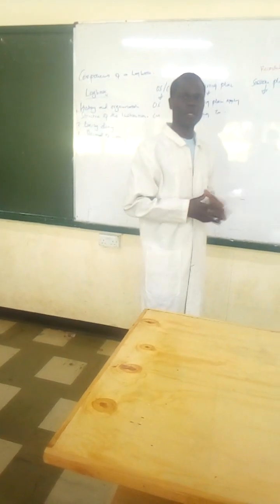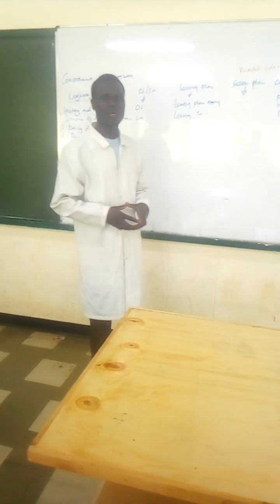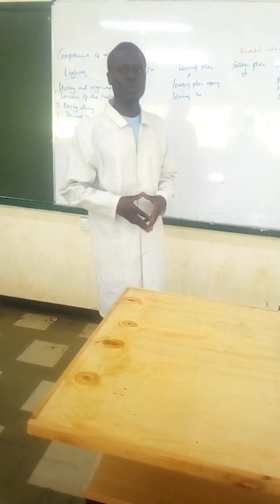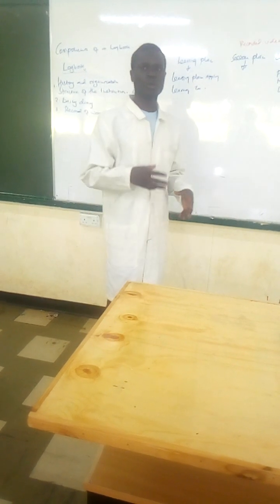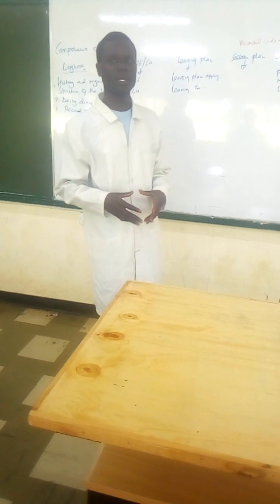So in this subtopic, you will know what gram staining is and the type of staining we normally apply. Gram staining is just a method of staining we normally use to classify bacteria into two broad groups, either gram positive or gram negative.